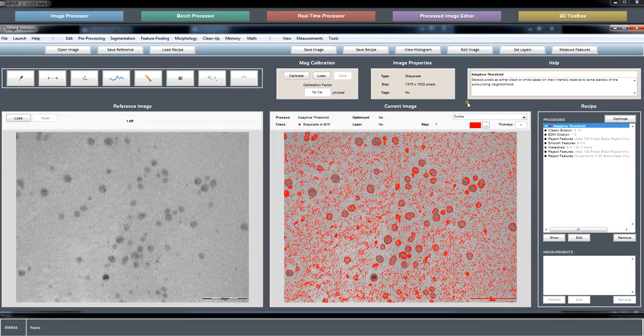Johan, we don't have the ability to burn on a scale marker right now. I know that's a pretty popular function of ImageJ, and I can add that to the list of things to add as a recipe function if you want the ability to burn on a scale bar. I think that would be a nice feature. So I'll put that on the list. Thank you.